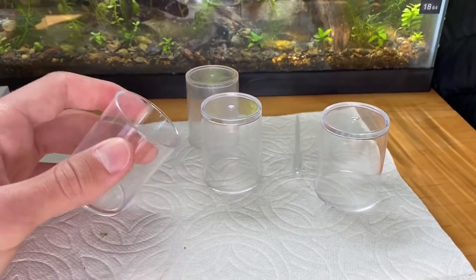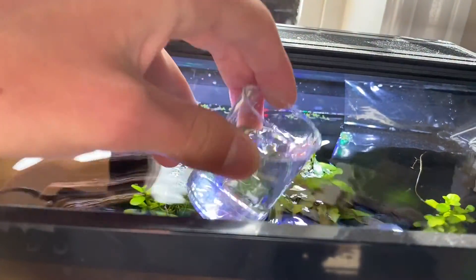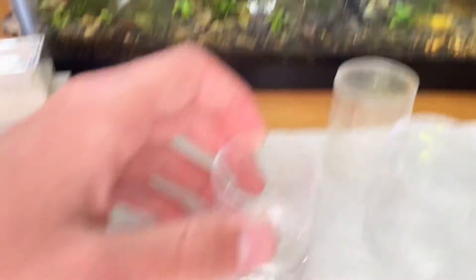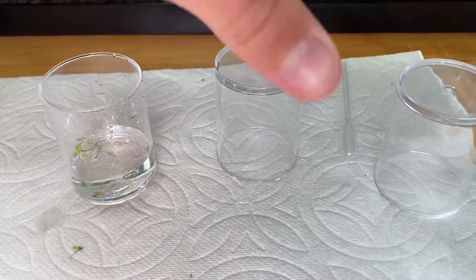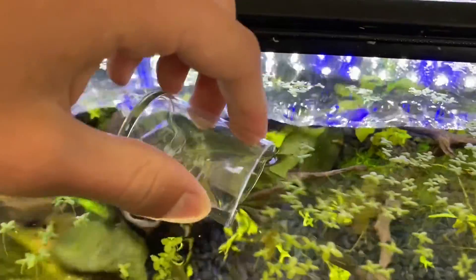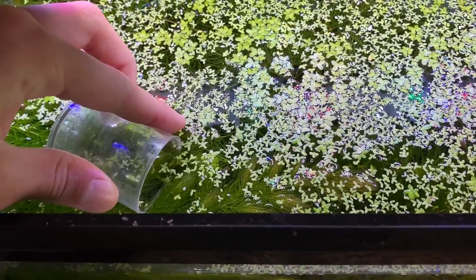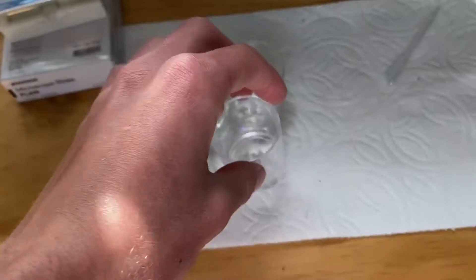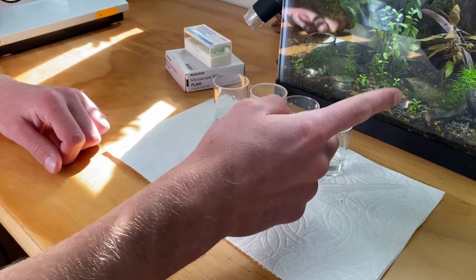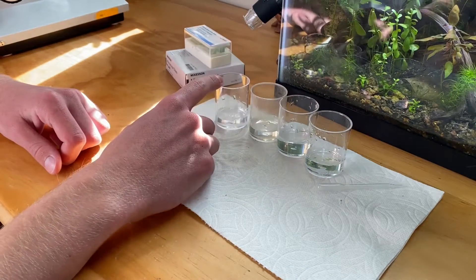So what I have here are just some little cups, and we're going to go and just scoop up some water. That's a little too much, I don't think we're going to need that much, but just going to scoop up a little bit of water from each of my tanks. So let's get the 20 gallon, the other 5 gallon, and the big tank. So we got the water - we have the 5 gallon, the 20 gallon, the other 5 gallon, and then we have the 40 gallon.